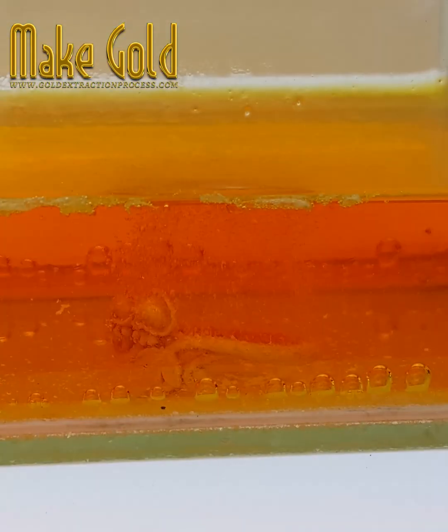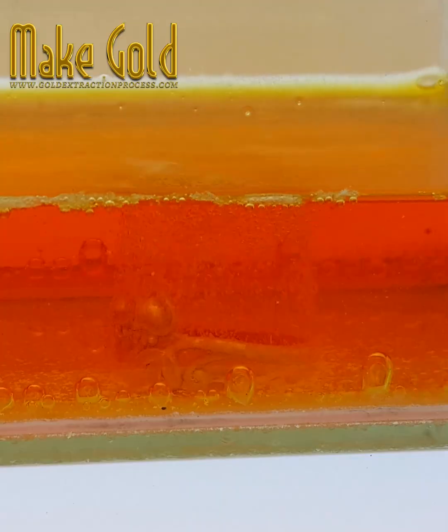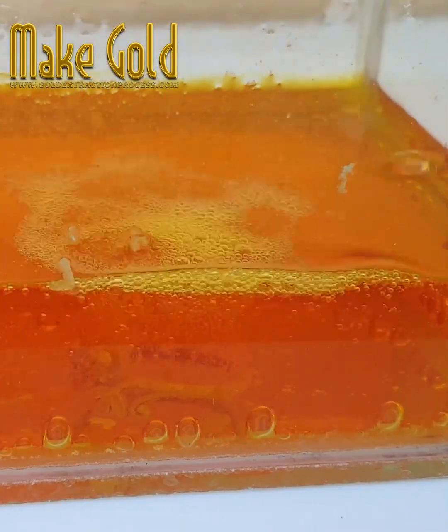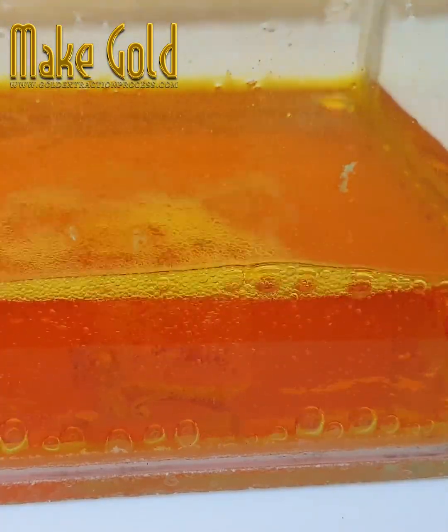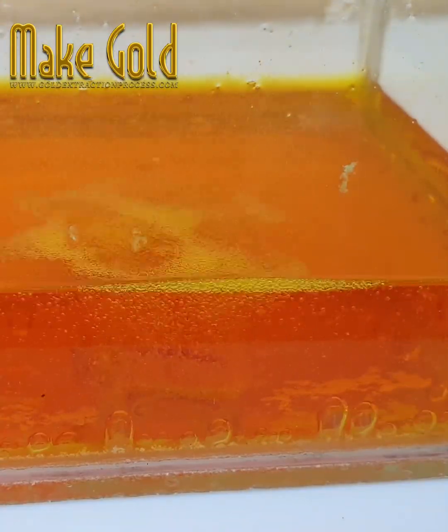In that case, you purify an outer layer but the internal layers are not pure because they are protected by an insoluble layer of gold. To fix this, we can add hydrochloric acid to the nitric acid so the gold is all dissolved, and then selectively precipitate out the gold.